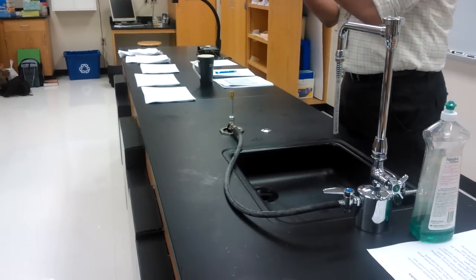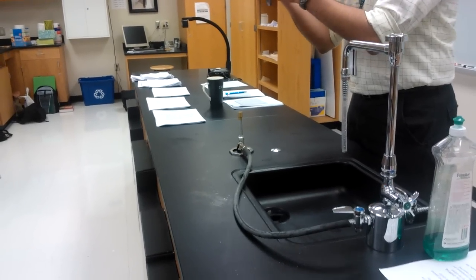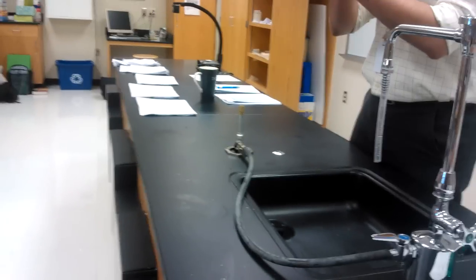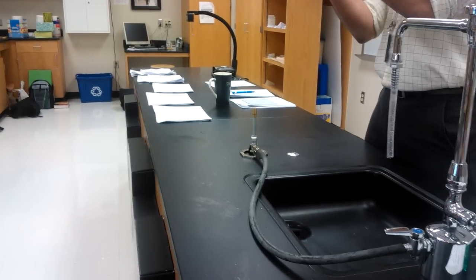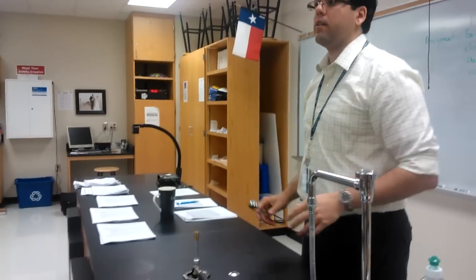Alright, so the striker works by swiping across creating a spark. In order to get a good spark, you need to pull towards you and pull across. The spark should look like this. That's a good spark. You should be able to do it once and that should be enough to light your Bunsen burner.